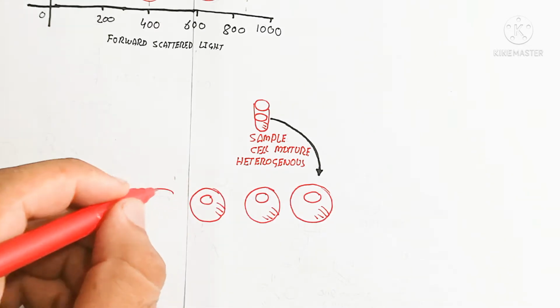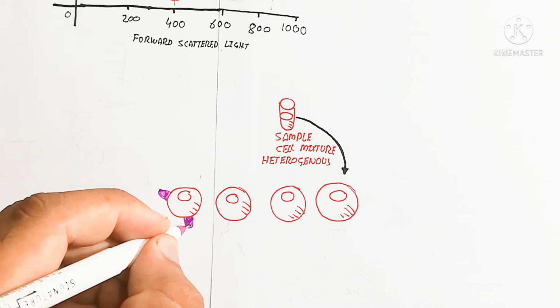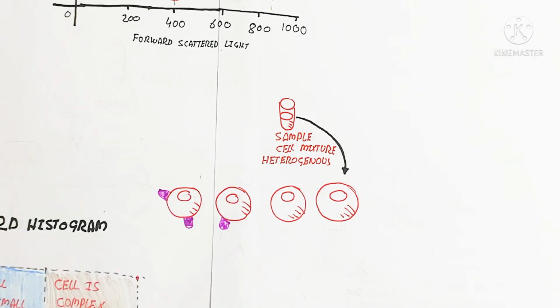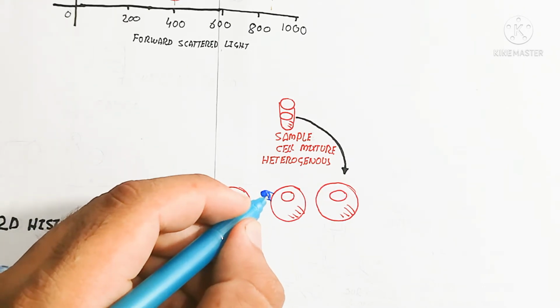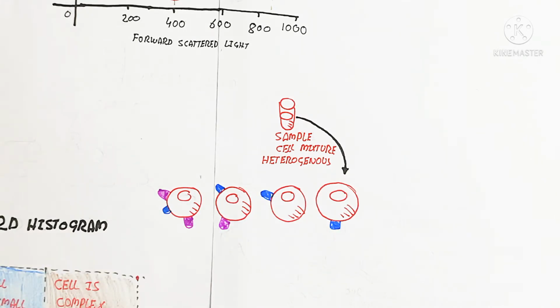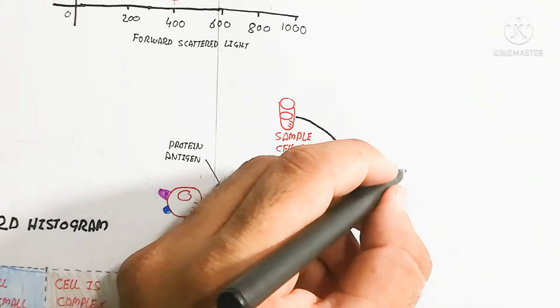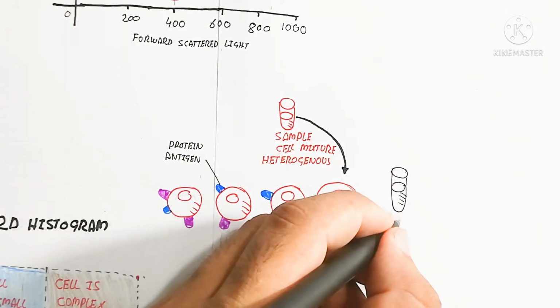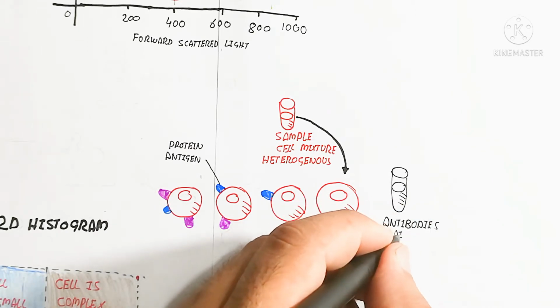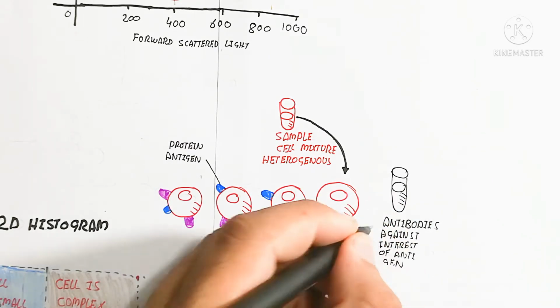So for this blood, we prepare an antibody containing a fluorescence-producing fluorophore, which is attached to the antibody to show the complexity on the basis of producing light. So here is the protein on the surface of the membrane of these different types of cells, which differentiate on the basis of their surface protein as an antigen or receptor.